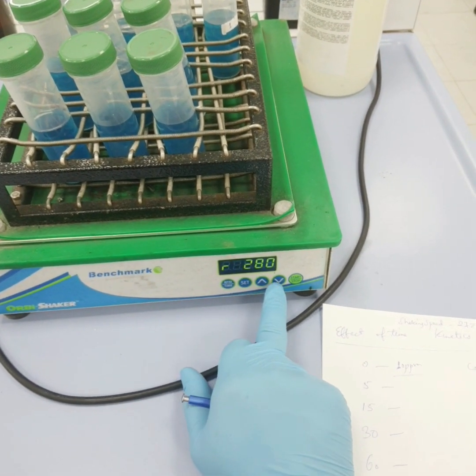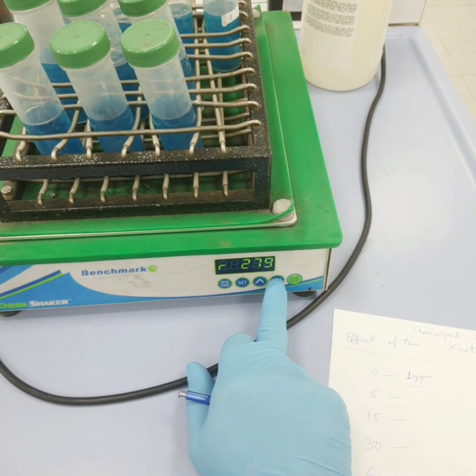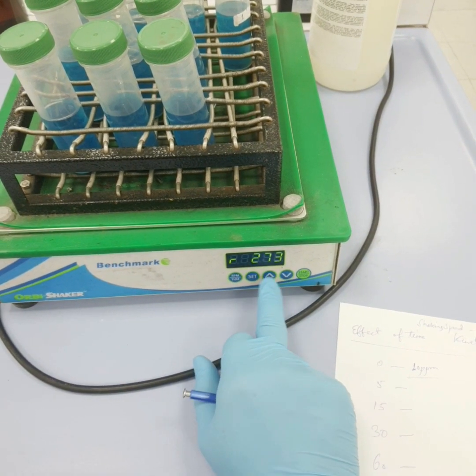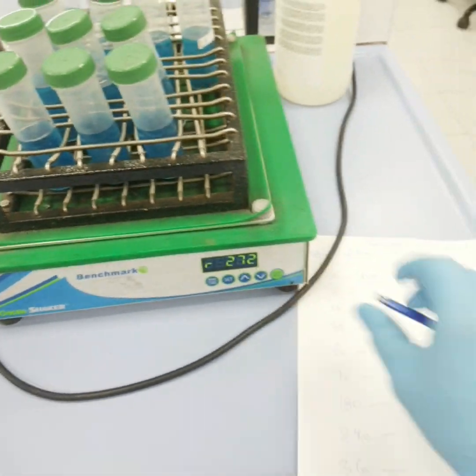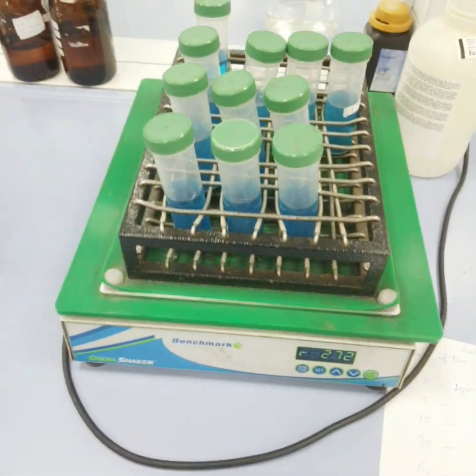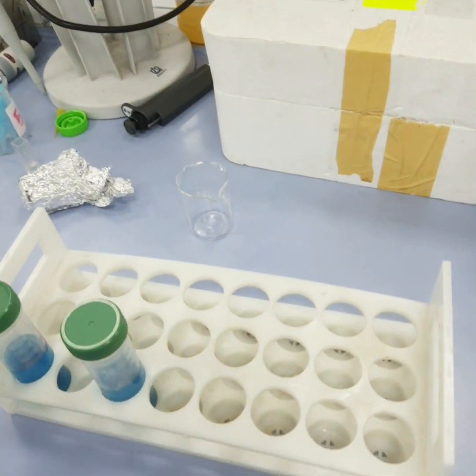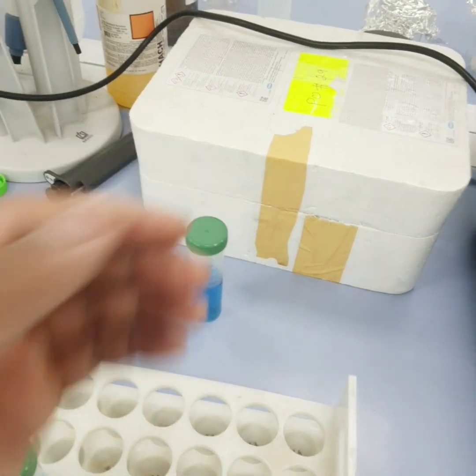Then RPM we will set. Okay, now we'll start shaking. So after 5 minutes we will measure the concentration after centrifugation.